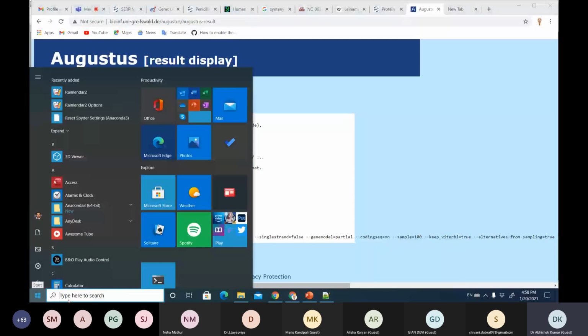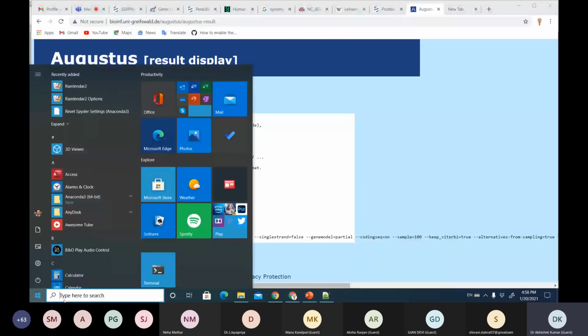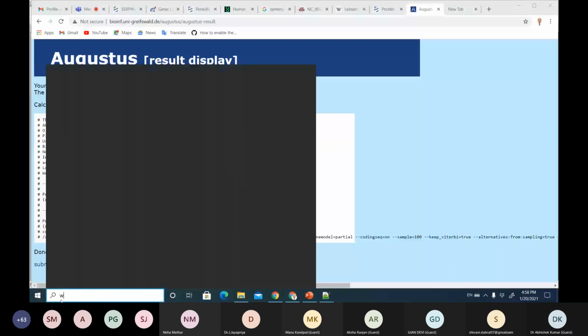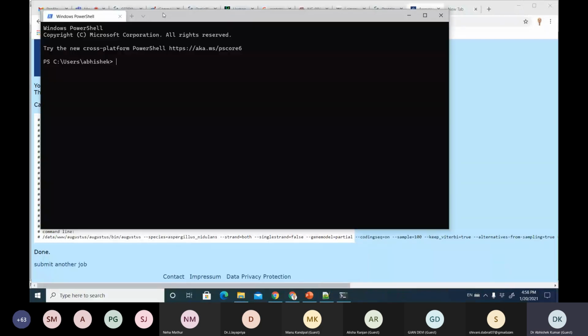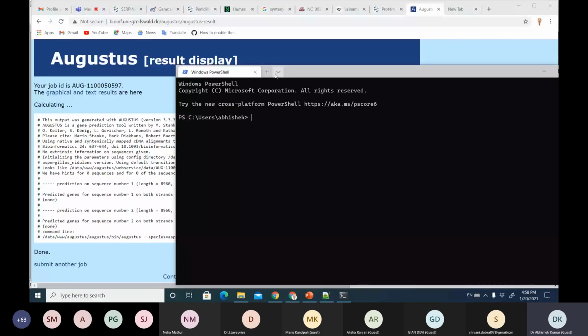In this computer we have it actually. If I look for the Windows terminal, I assume many of you know that Windows is using a Linux shell nowadays, built in. You need to optimize it. So I'm going to use Ubuntu.